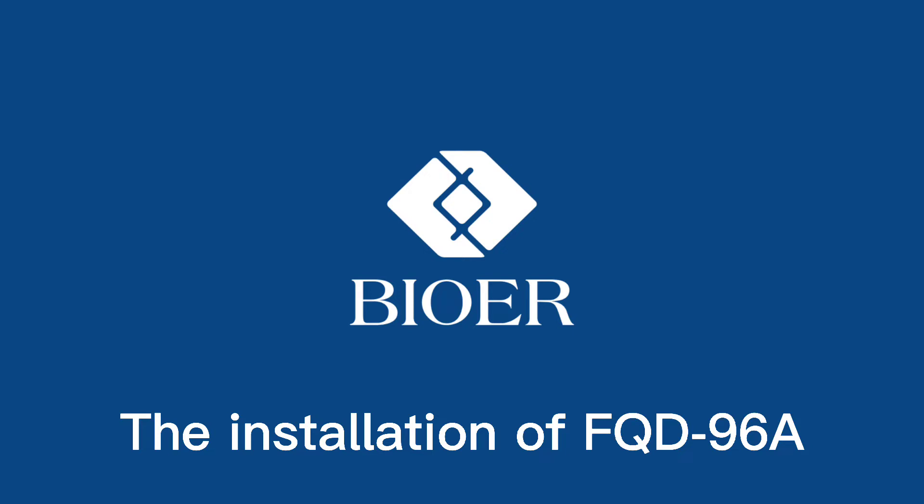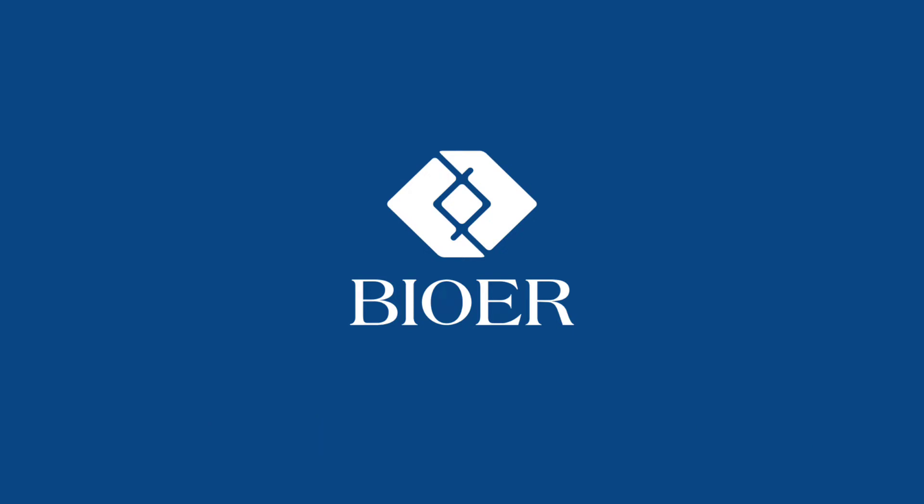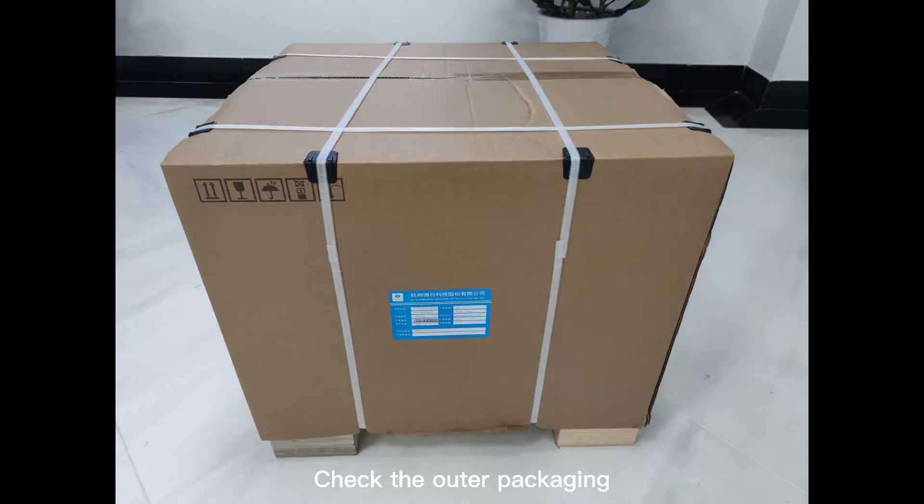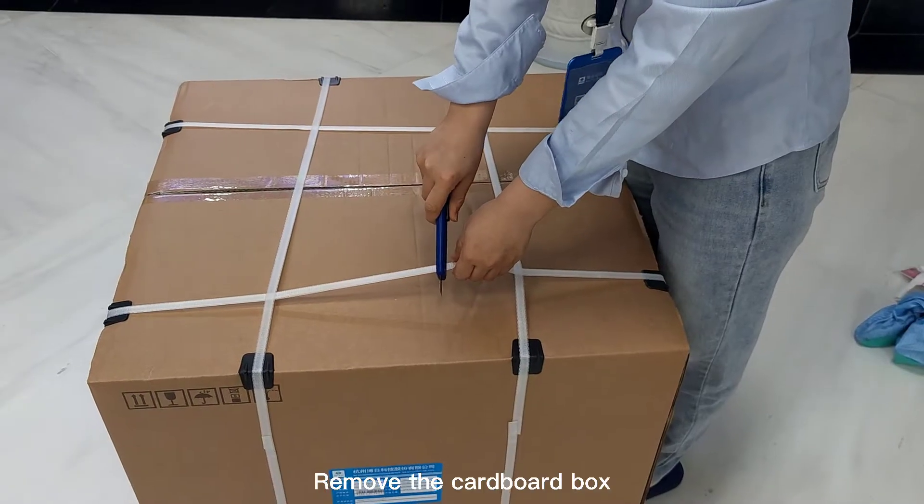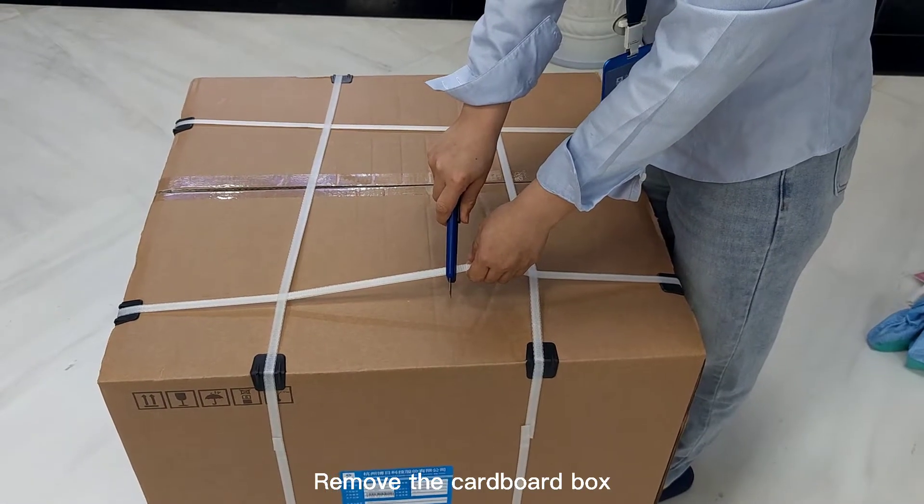The installation of FQD 96A. Check the outer packaging. Remove the cardboard box.